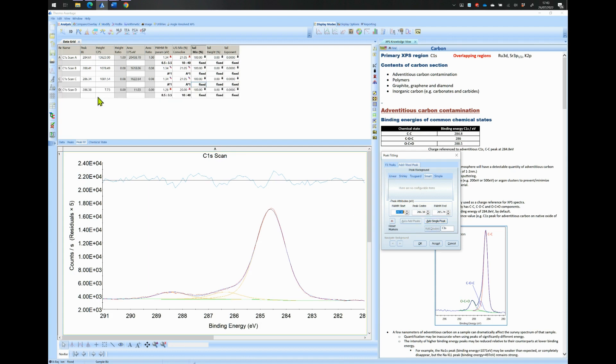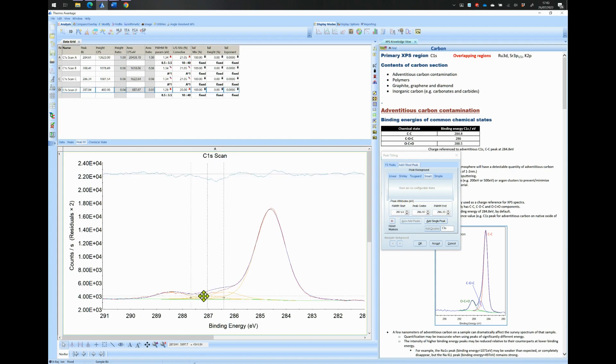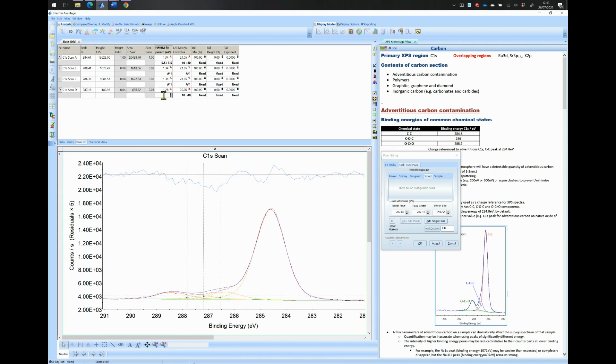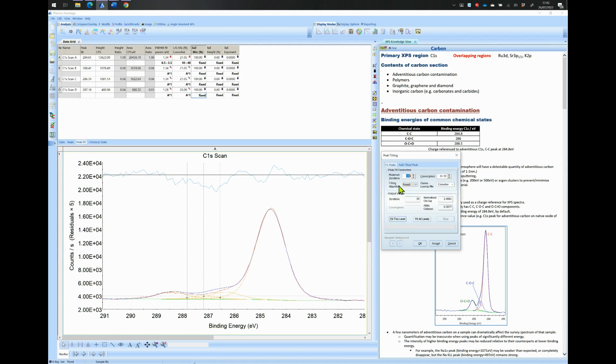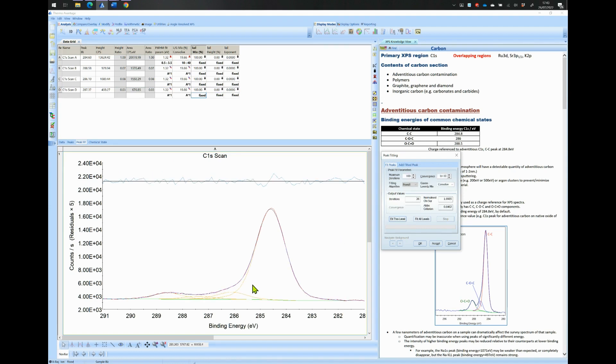Go back to the Add Fitted Peak tab and add another peak around 287 eV. Constrain it to peak A, the same way as we did for peak B and for peak C. Now click on Fit This Level button. The peak fitting model fits now well with our data. The width is 1.3 eV and the LG ratio is closer to 20%.